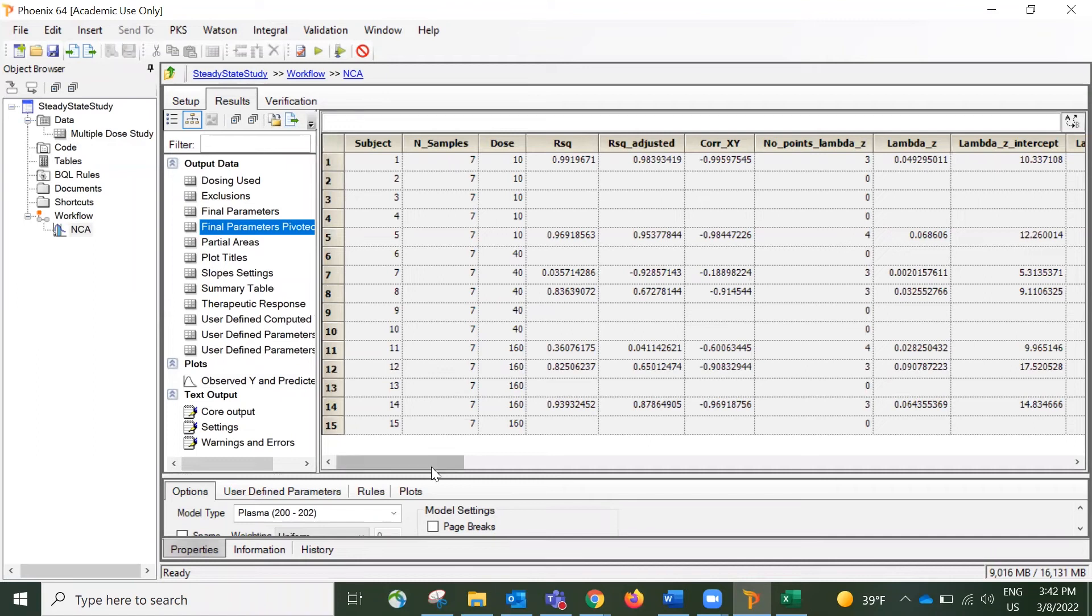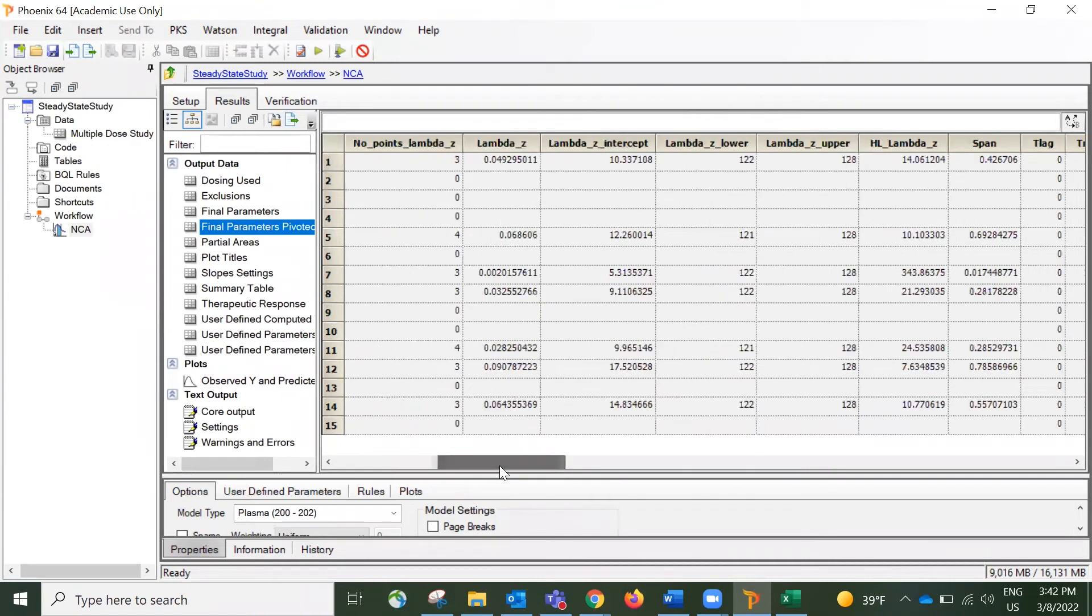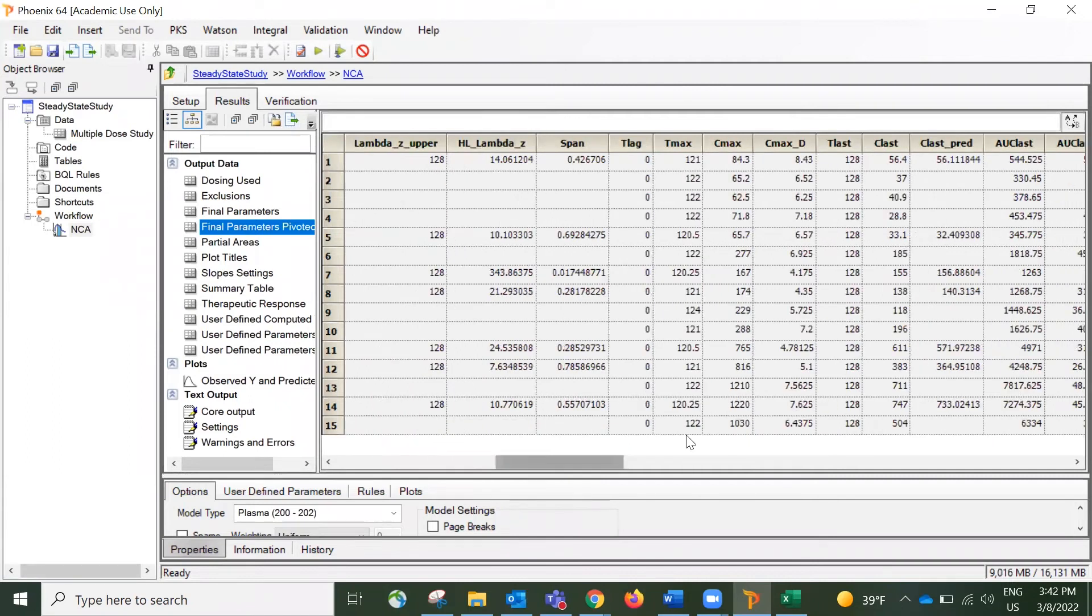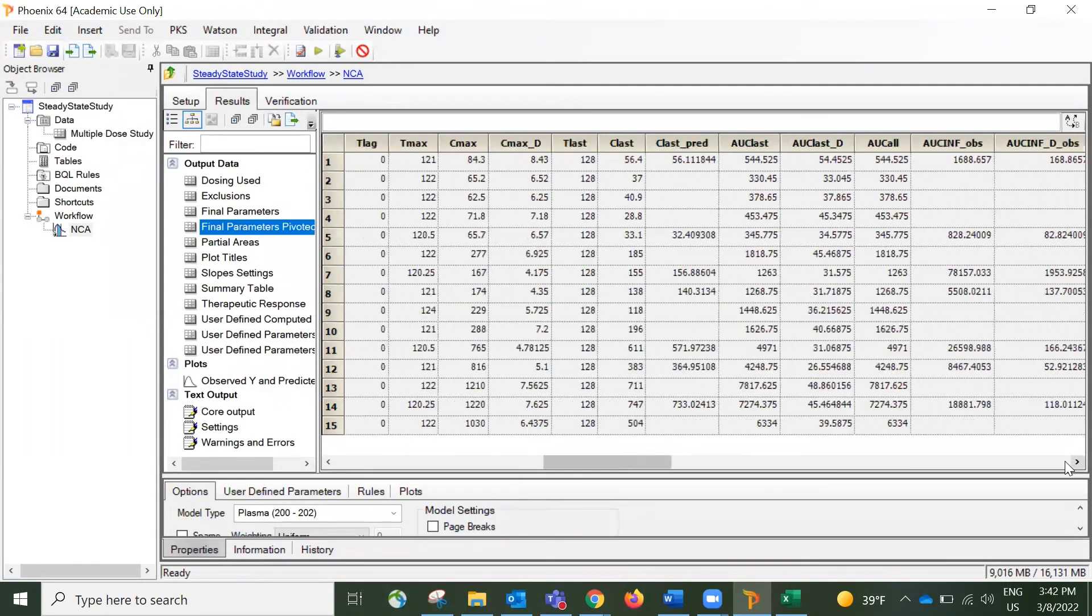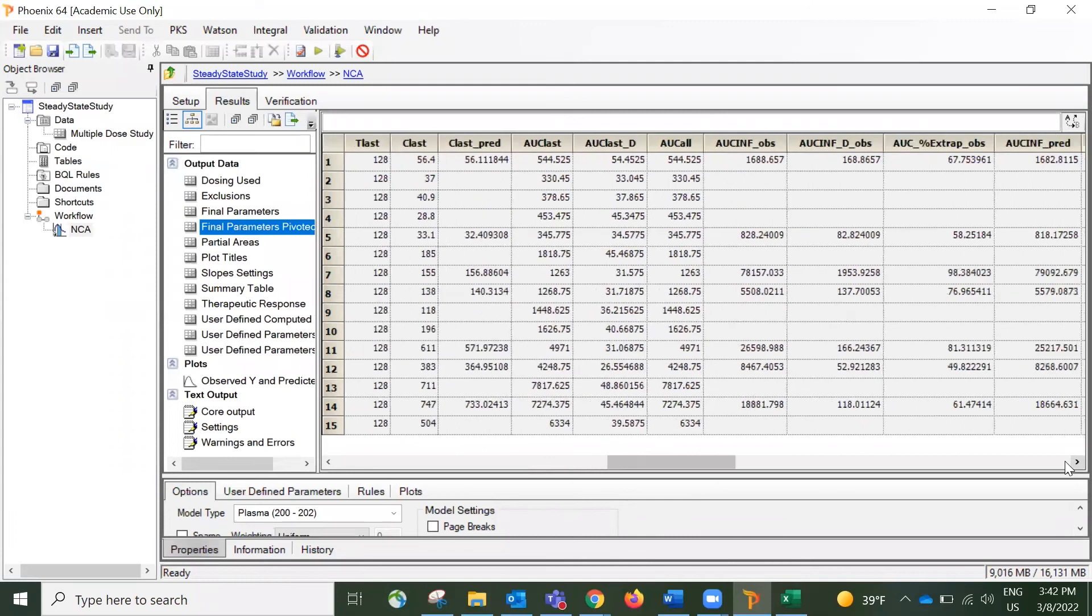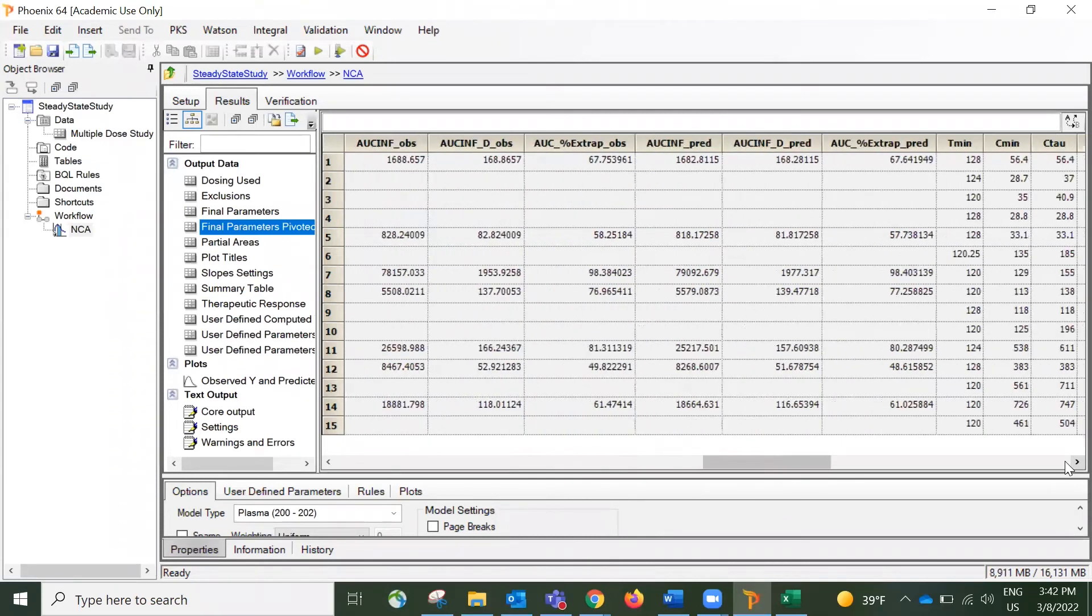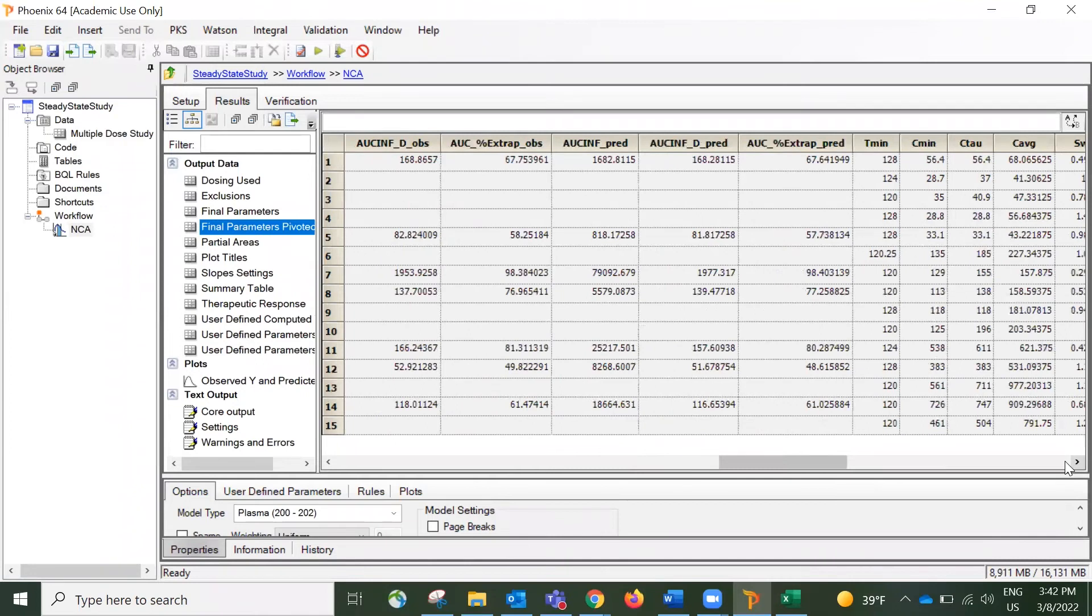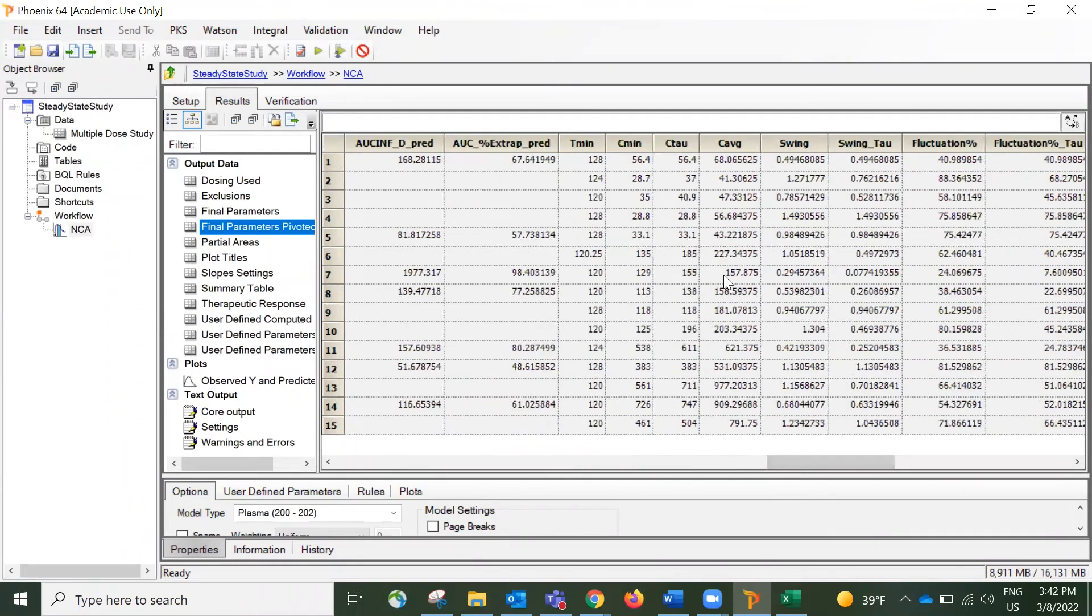Since this is an NCA analysis for steady-state, there are several PK parameters that we usually don't see for regular NCA analysis. So I'm scrolling to the right to see those parameters.